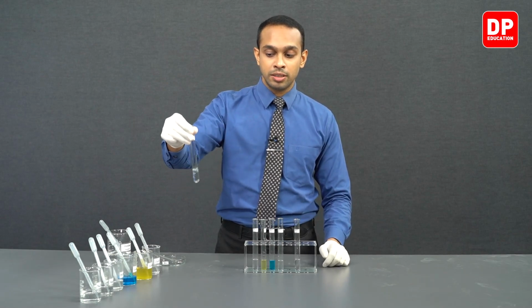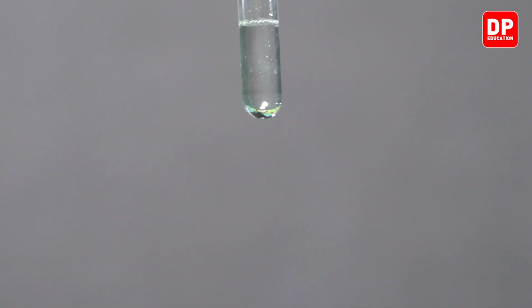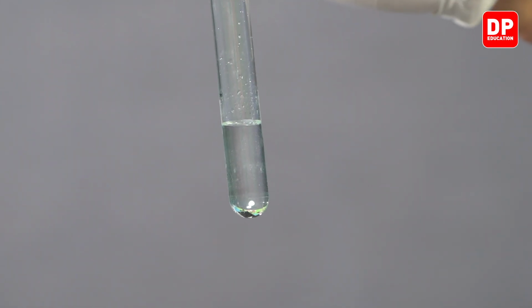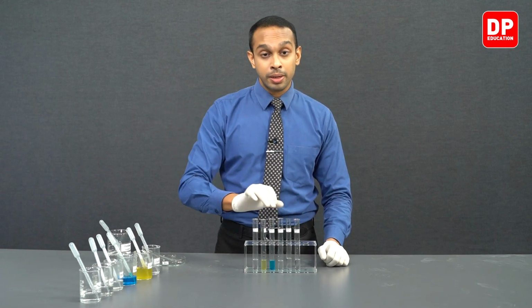Iron will not react readily like magnesium does with water. Iron will, however, be able to displace some of the metal ions, especially if iron is more reactive than the metal ion present in the medium.